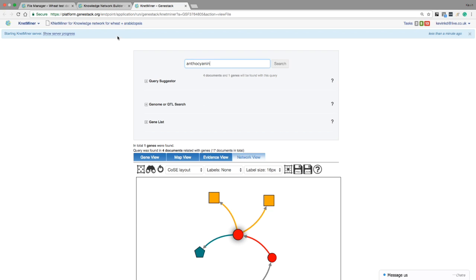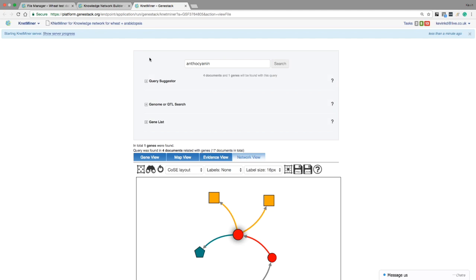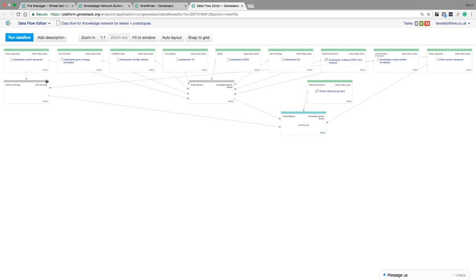We've seen how you can share data sources and the generated network, but in fact, you can also share your biological findings. The results that you generated are automatically saved, and you'll recover this view when you reopen this file or when you share this file with your colleague. The meta-info of each file keeps a record of how it's generated. It makes all the computation steps reproducible, and we can modify the data sources easily to update the network.